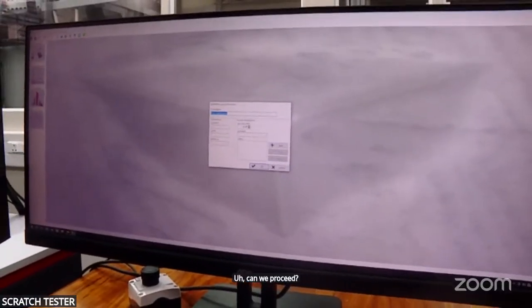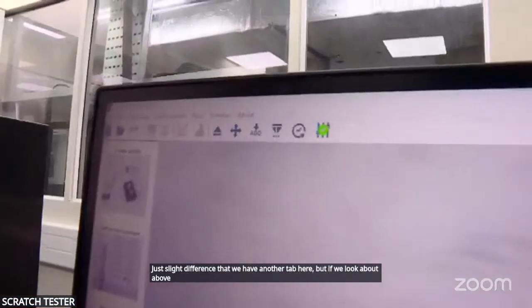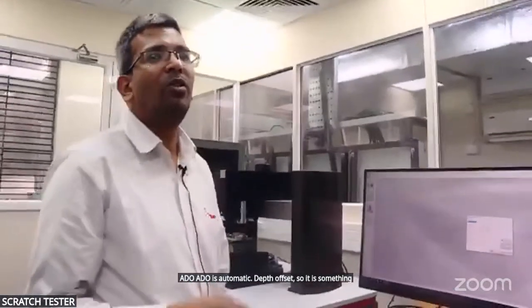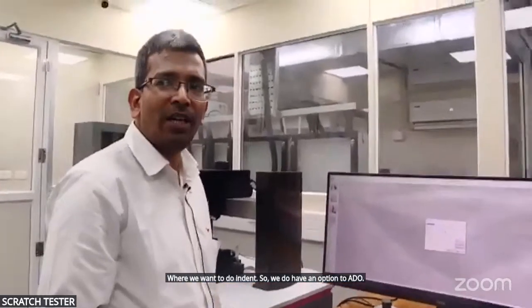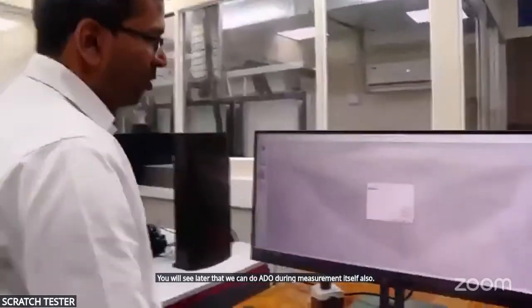Okay. So if we see, the software layout is kind of similar to what we had for Scratch, just a slight difference that we have another tab here, but if we look above, things are very similar. We have our safe position, it's automatic. ADO is automatic depth offset. It is something we do initially to find the surface of the sample where we want to do the indent. So we do have an option to ADO before starting. We focus the area and do the ADO, or, as you will see later, we can do ADO during the measurement itself also. So the first screen is kind of similar.